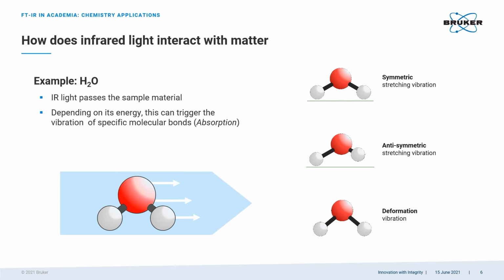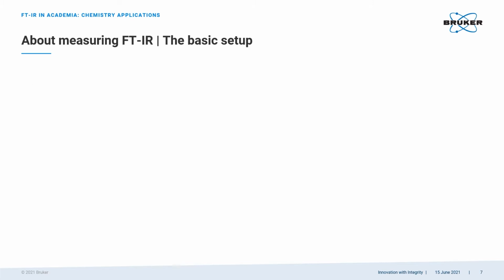The energy needed for this vibration is consumed in the process and therefore missing from the original IR beam. This missing information gives us clues about what kind of vibration was excited.